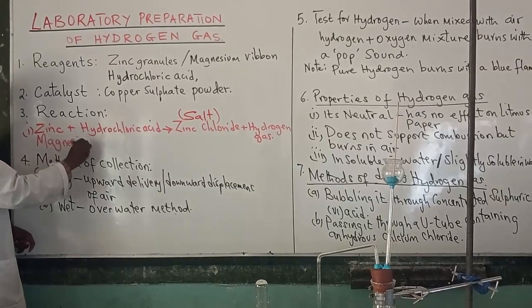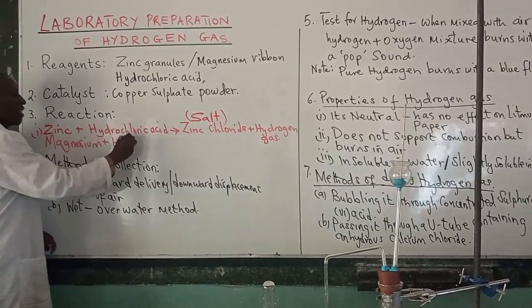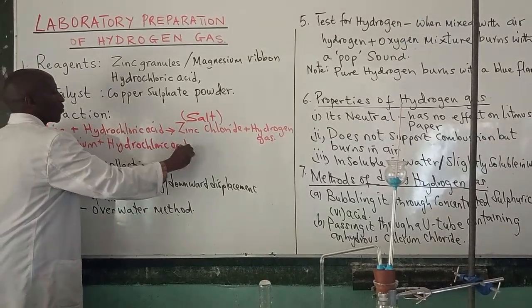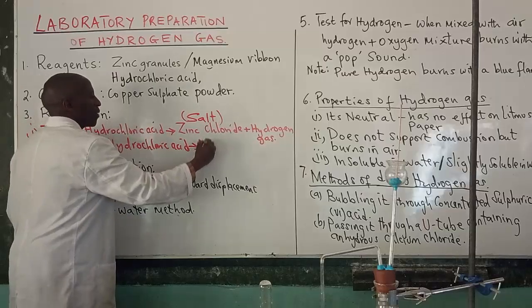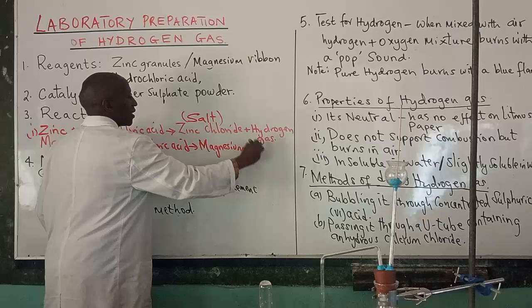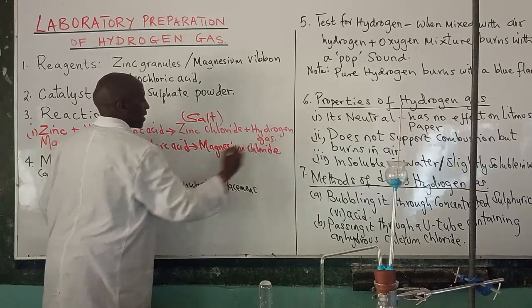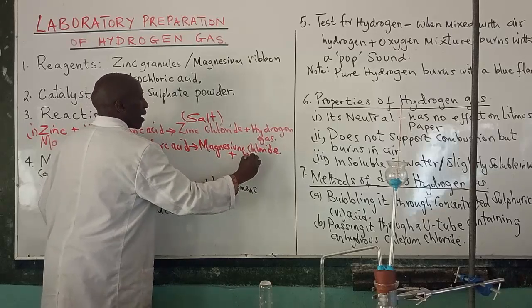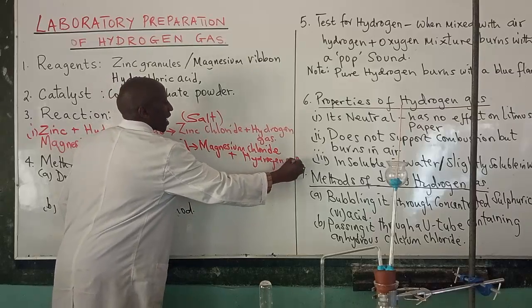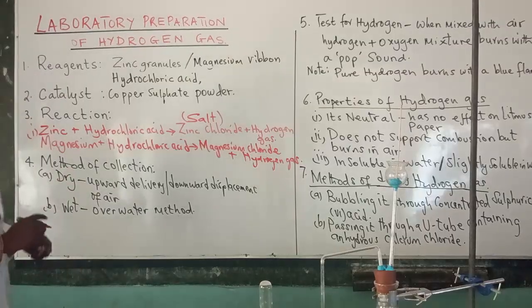It has reacted with the hydrochloric acid, and so we have gotten magnesium chloride as the salt, and hydrogen gas.